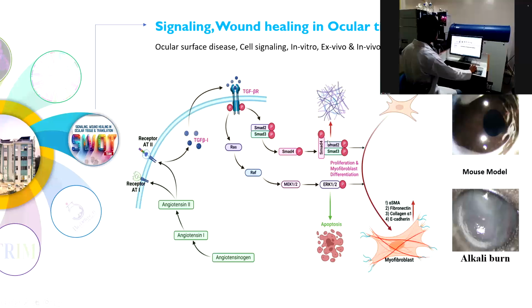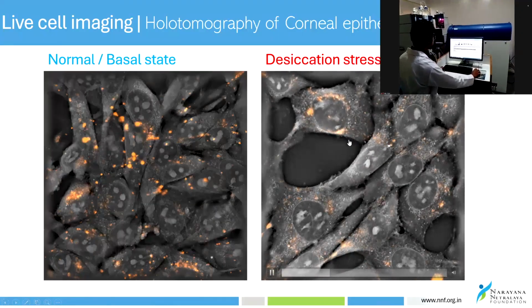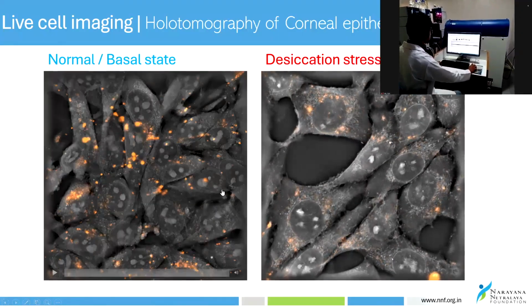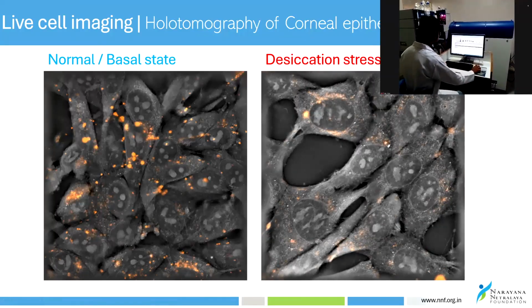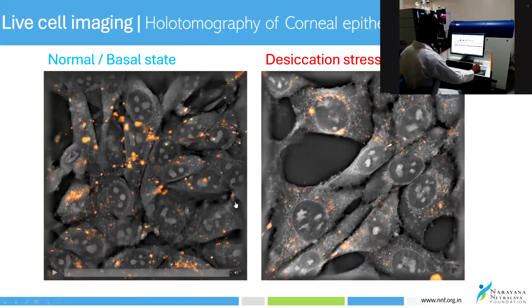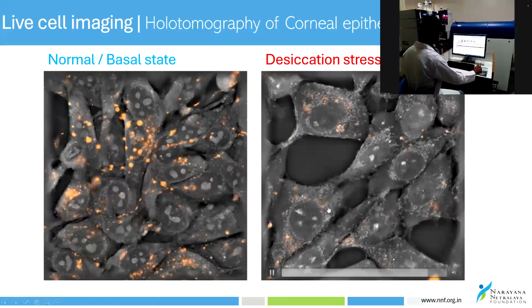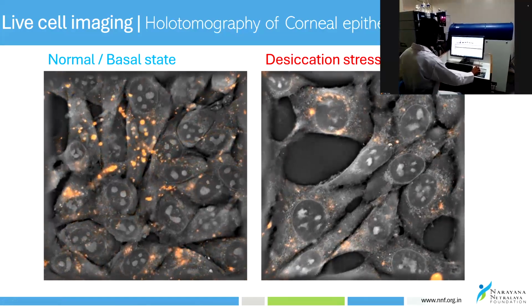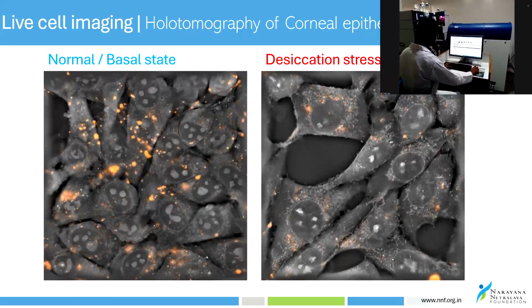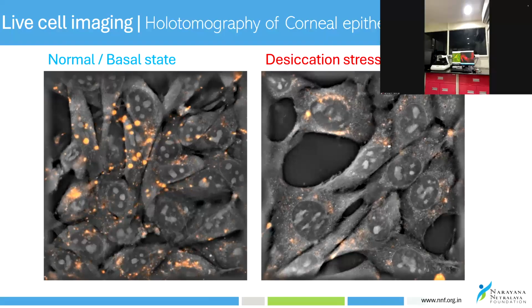Again, we need this. So if you can go to the holotomography ones. Yeah, these are holotomography experiments. If you can patch the holotomography. These are an excellent demonstration. If you go back to your MBBS or even your biology classes, you would see a cell with mitochondria and all those images. You can actually see all of them.